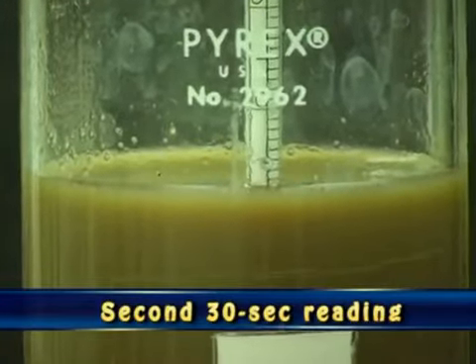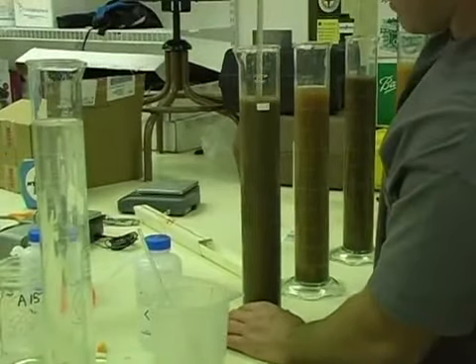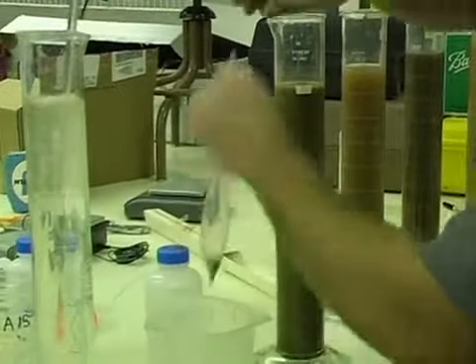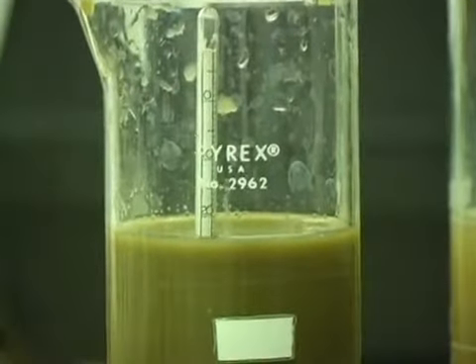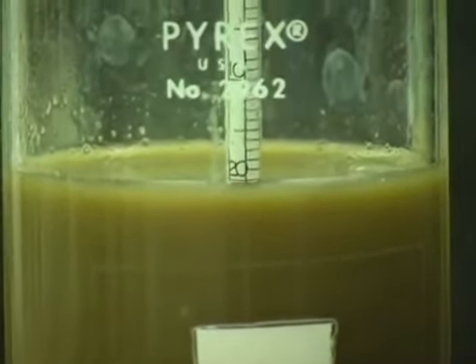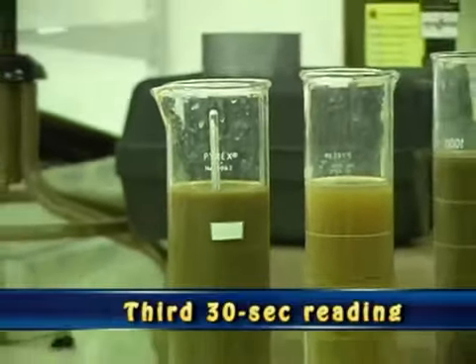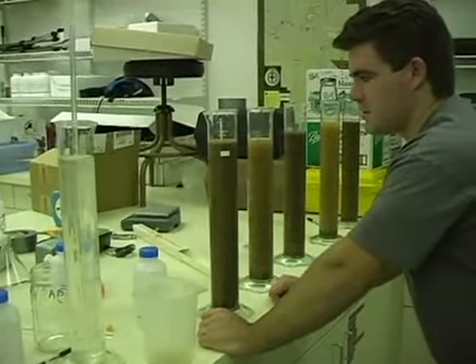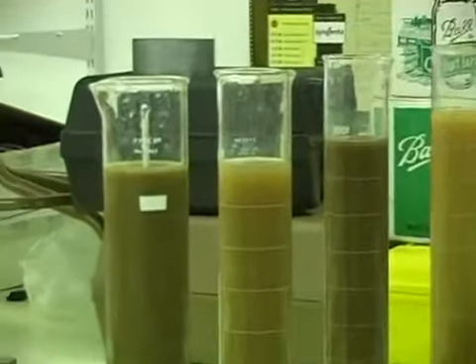1. 23. Just leave it in. No, not till the third one. Now we're going to take a third 30-second measurement. And then leave this one for the 60. And after the third 30-second measurement, you're going to leave the hydrometer in and wait for 60 seconds. 3, 2, 1. 17.